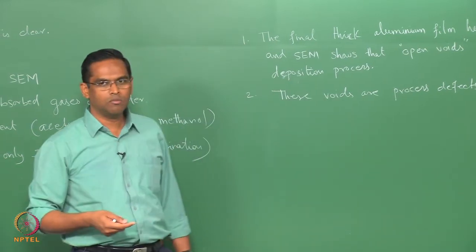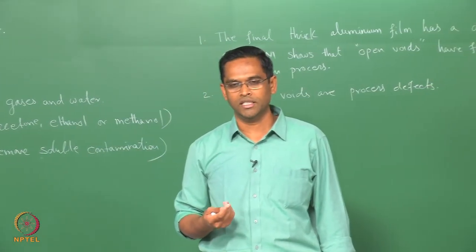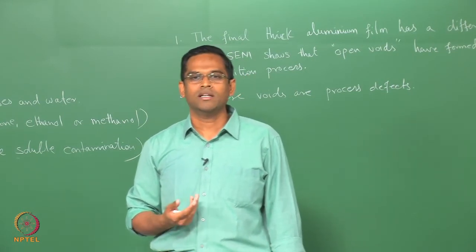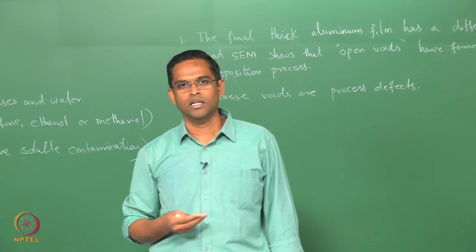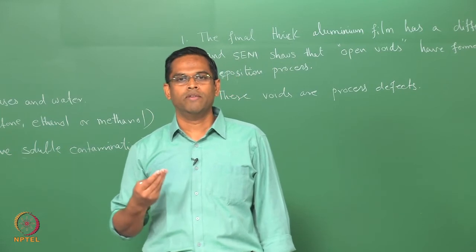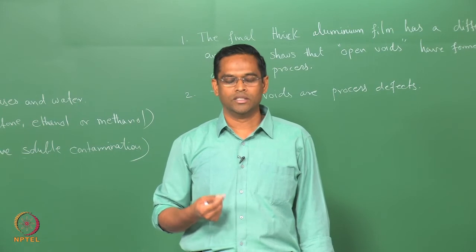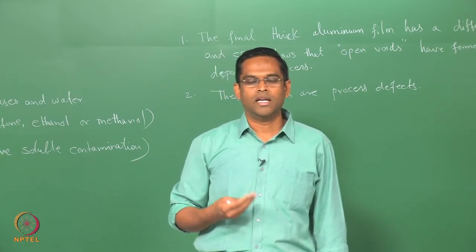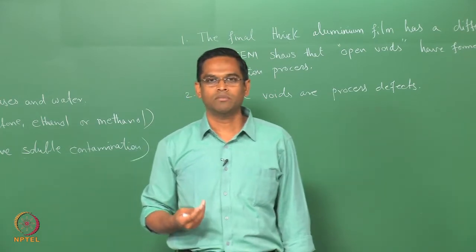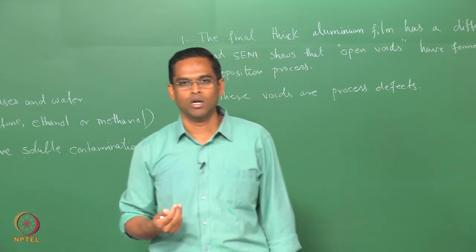So, I will now move on to the other important use of this SEM in this case study, called microanalysis. See, the microanalysis can be done by 2 or 3 methods depending upon the detection capability. One of the very common uses of microanalysis is by energy dispersive spectroscopy or spectrometer, which is an attachment to an SEM or a TEM and so on.